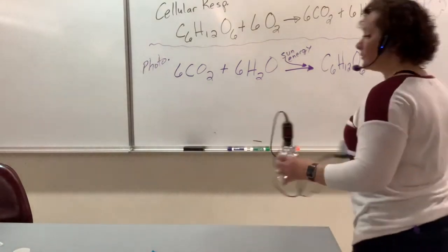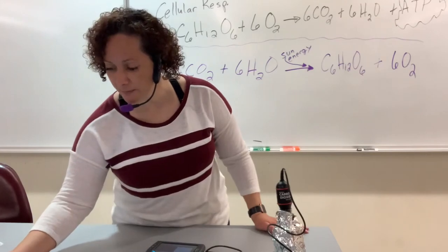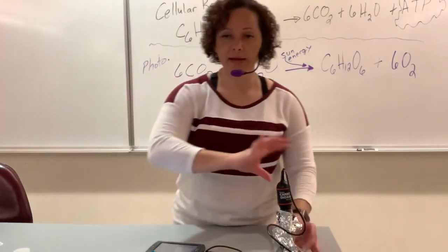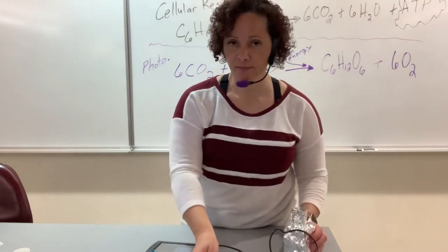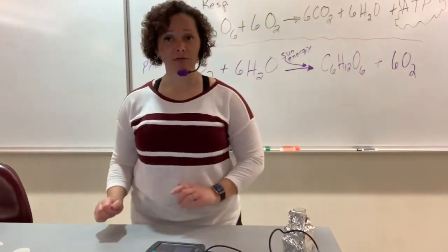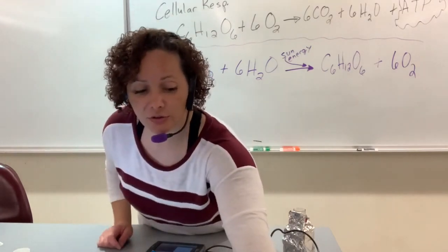All right, so where do you write this information? Let's go ahead and take a peek. Oh, by the way, pull this out. Let your organisms breathe while you're writing everything down. That is crucial, okay? That is so crucial to do.